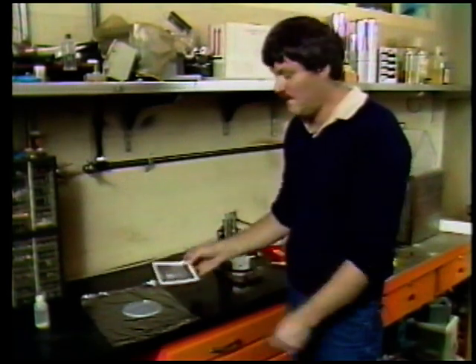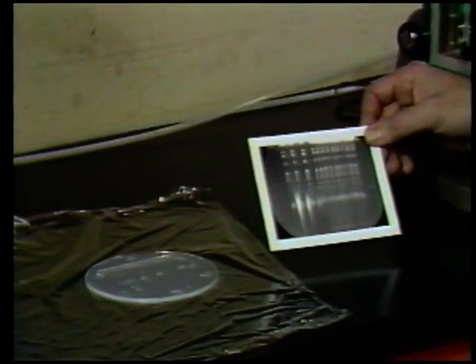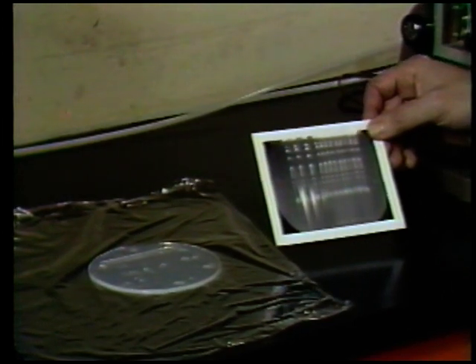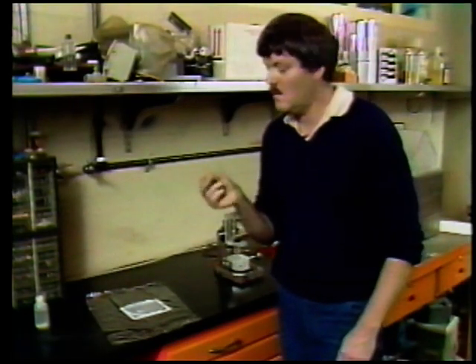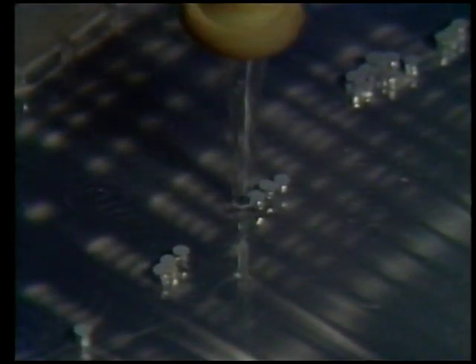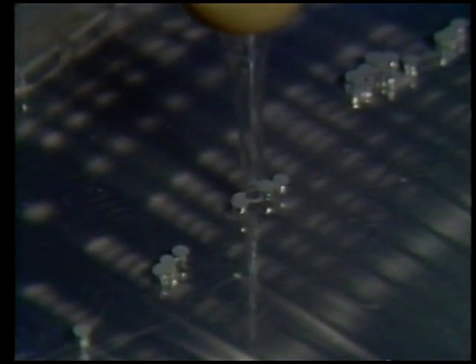And here's a photograph of that gel taken at full scale so that the dimensions of the gel are the same as the dimensions of the photograph. I simply slip the photograph underneath the gel, line up the wells from the gel with the wells in the photograph, and then take this thing, which is like a cookie cutter, similar to a Pasteur pipette, and punch out a particular band of DNA that I'm interested in.